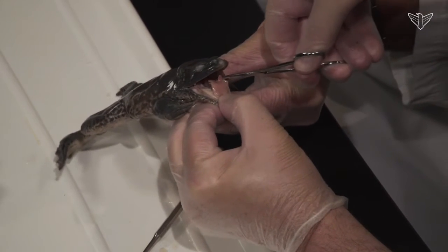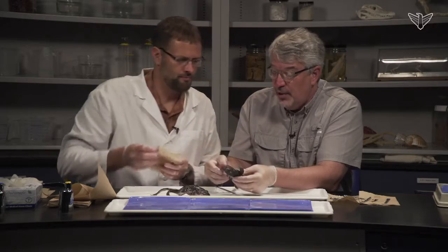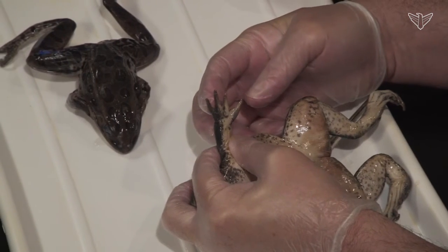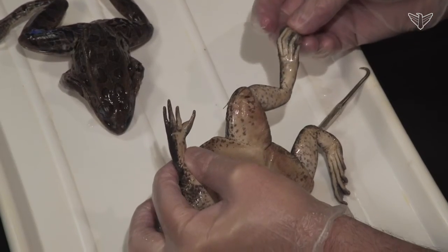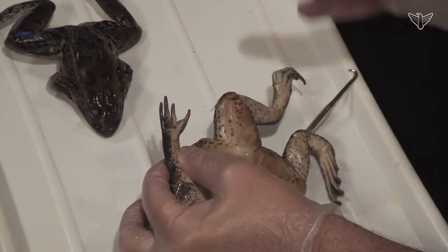I keep saying him. Any real good way to tell? Well, it's hard to tell externally. There's a possibility with many frogs, and actually here's an interesting thing with amphibians, they have 4 toes on their front foot and 5 toes on their back, whereas all the other tetrapods, reptiles, birds, mammals, have 5 on the front and 5 in the back.